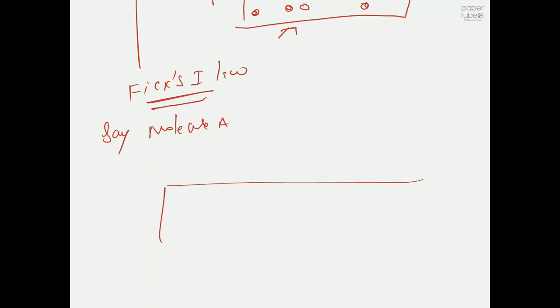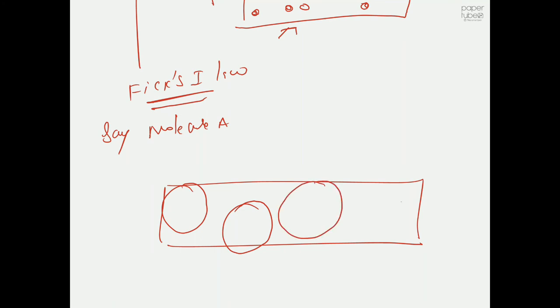So just assume, it can say this is one silica particle, another silica particle, another silica particle, another silica particle. They all have some spots that can adsorb, or the surface on the pores, the surface that bounds the pore. So they all can adsorb your molecule A.